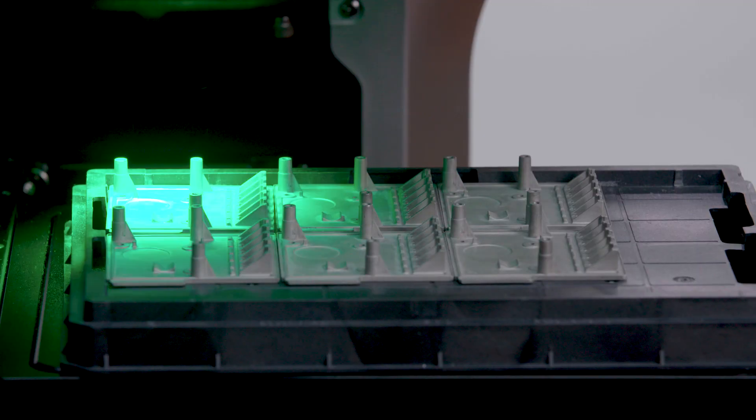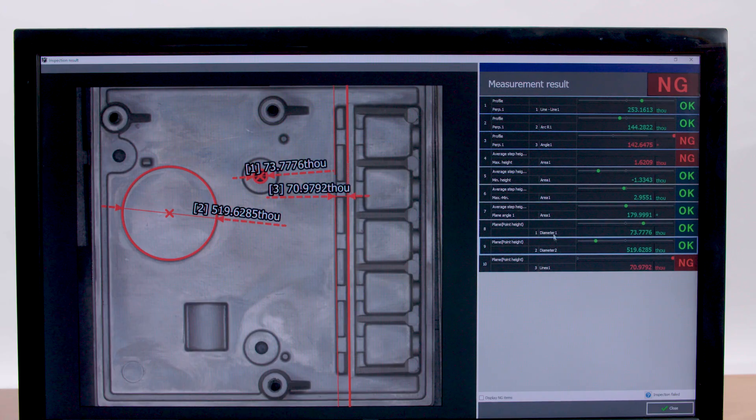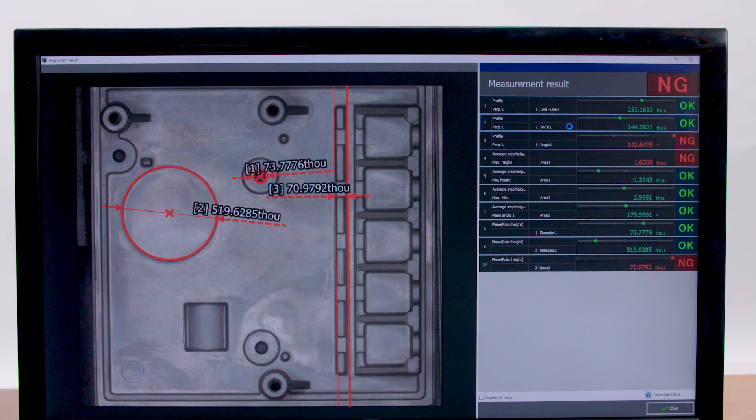Entire trays of parts can be scanned for analysis or measurement tolerances can be input to perform pass or fail inspection.